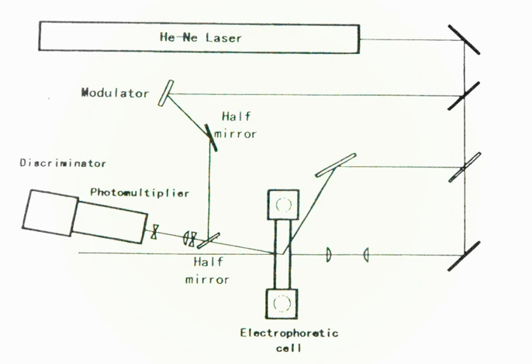It has also been shown that electrophoretic mobility data can be converted to zeta potential values, which enables the determination of the isoelectric point of proteins and the number of electrokinetic charges on the surface. Other biological macromolecules that can be analyzed with ELS include polysaccharides. pKa values of chitosans can be calculated from the dependency of electrophoretic mobility values on pH and charge density. Like proteins, the size and zeta potential of chitosans can be determined through ELS.